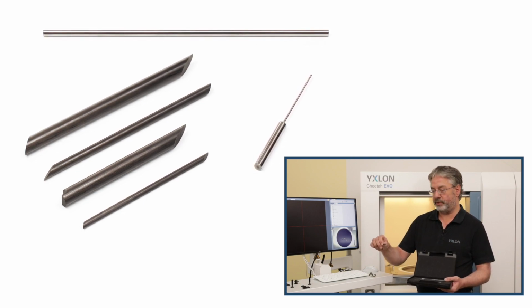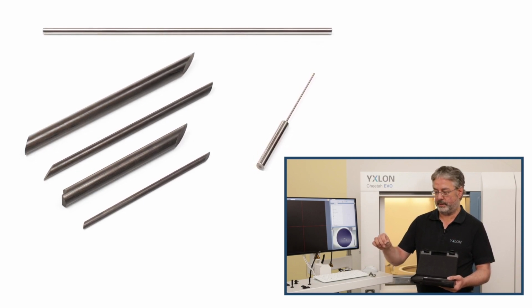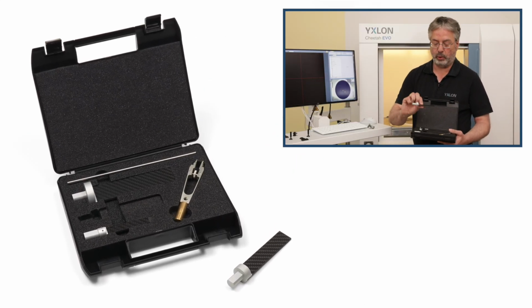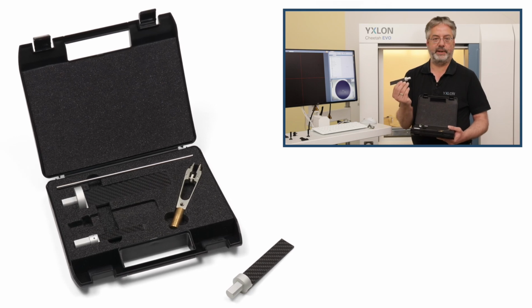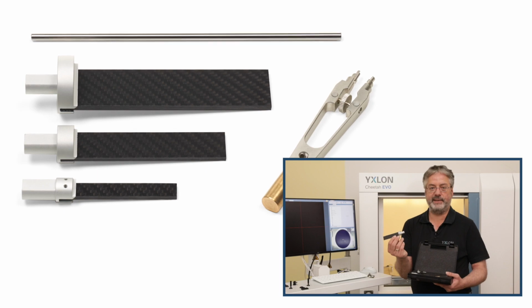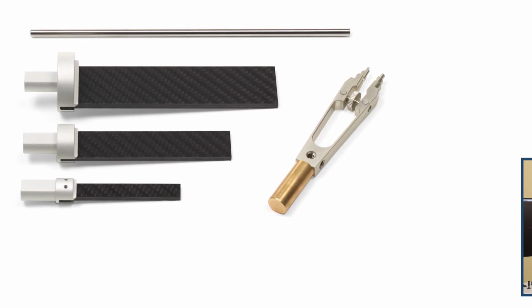So it's very good, and you can reduce artifacts here. If you have bigger samples, you can use sample holders like this one here. It's very easy to mount, just use hot glue, that's it. You can remove it very easily later after the CT acquisition.